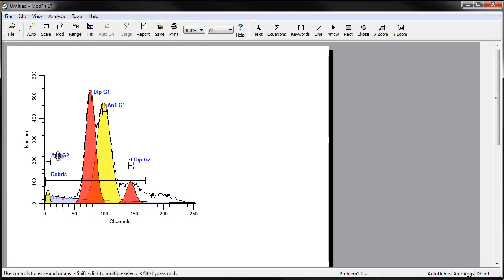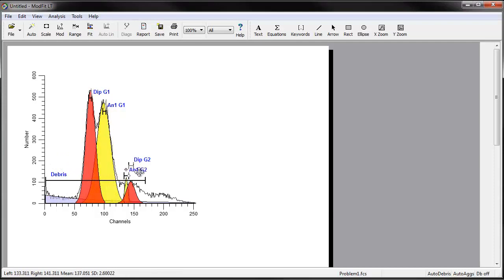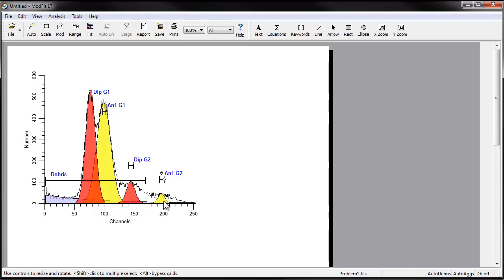Move the AN1-G2 range to about twice the position of the AN-G1 range. This also is the approximate position of the aneuploid G2-M. These G2 positions are not critical as the modeling process will adjust them.